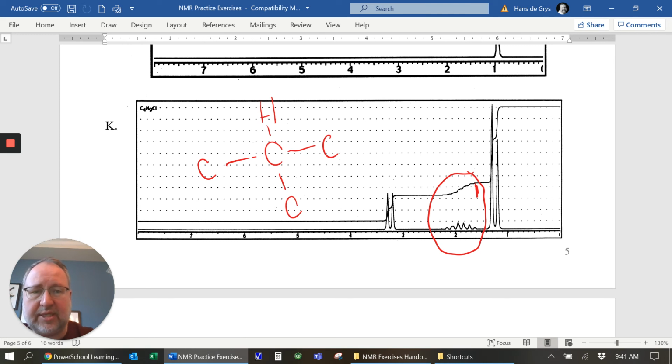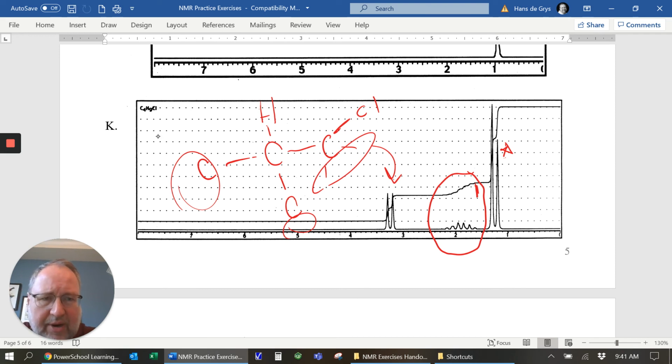And so this actually is the structure. One of these, of course, has a chlorine. And so the hydrogens that are near the chlorine, these two are this, and the other 6 hydrogens are going to be this over here. So all 3 of these and all 3 of those are this one over here. There's a little bit of overlap or coupling here. In an ideal case, this would be a symmetrical doublet, but you see it's not. Don't stress too much about that.